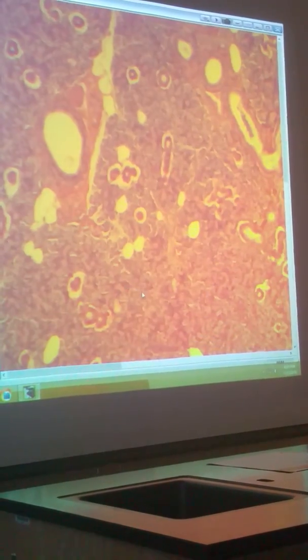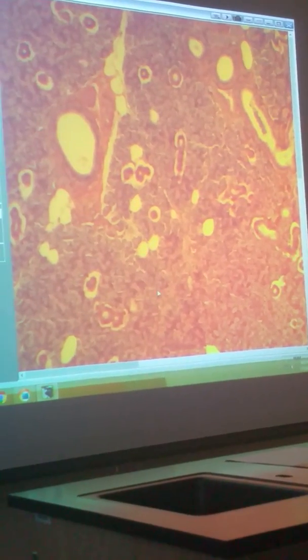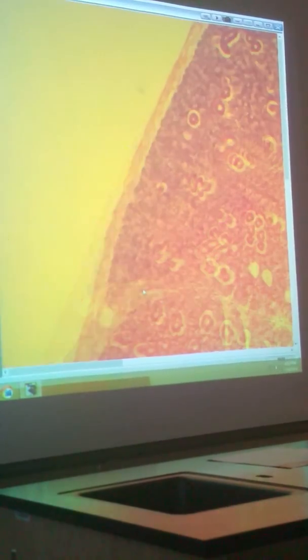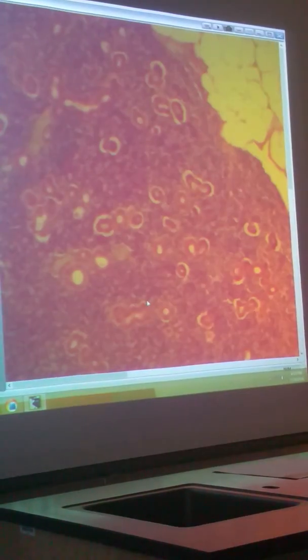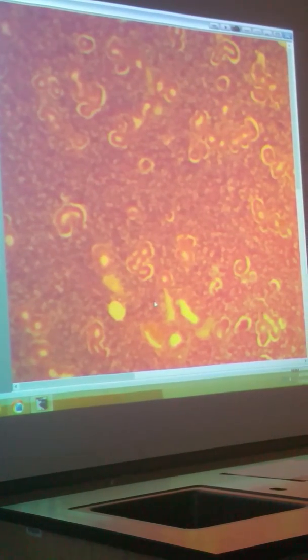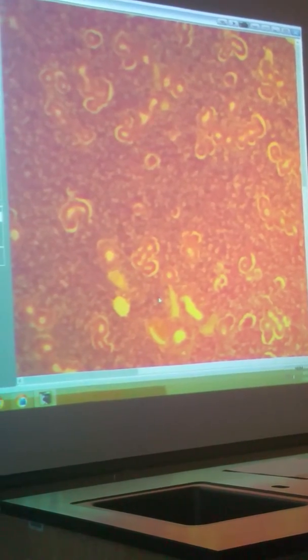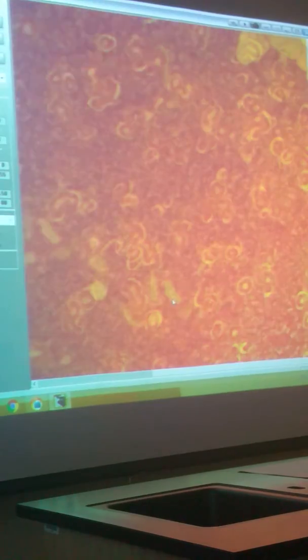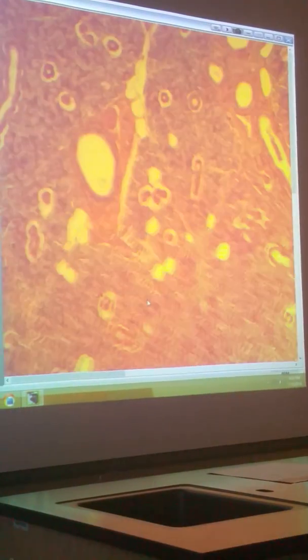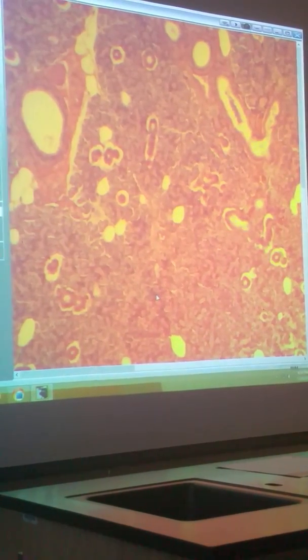Now this is low power, and let me show you another one before I move over to the other one, the last one first. This is the last one, and this is the one before the last one. Let me blow it up a little bit so you can see it a little better.